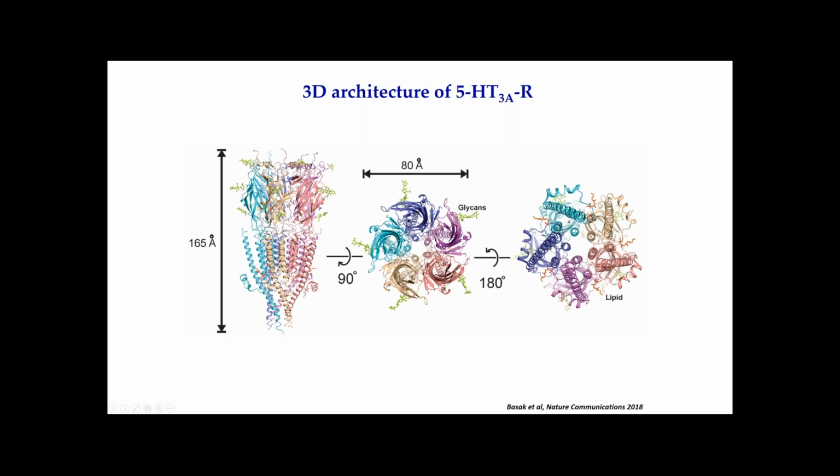the intracellular domain. We were somewhat disappointed in that even though this is a full-length protein, we did not resolve much beyond what was previously solved in the crystal structure. And this was also sort of expected because this is the region that is unstructured. This is the top and the bottom view of the receptor.